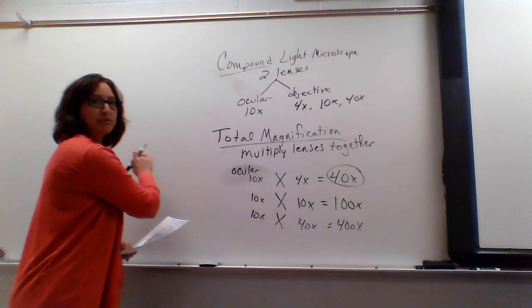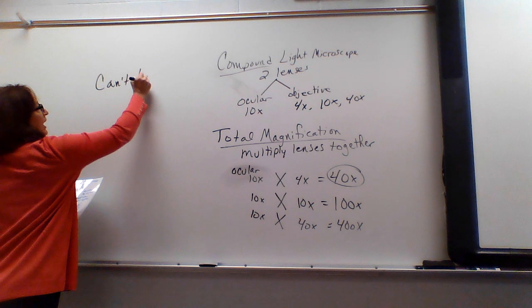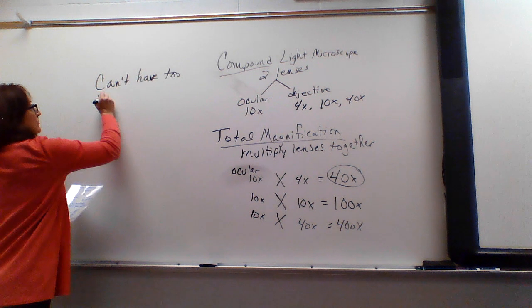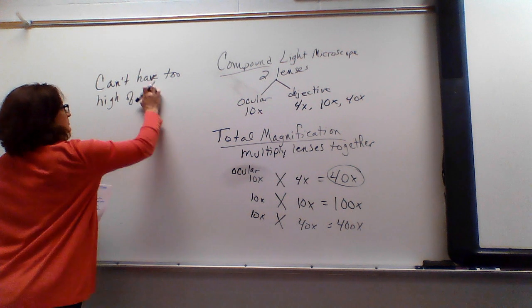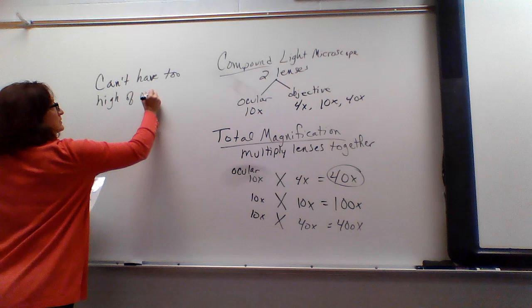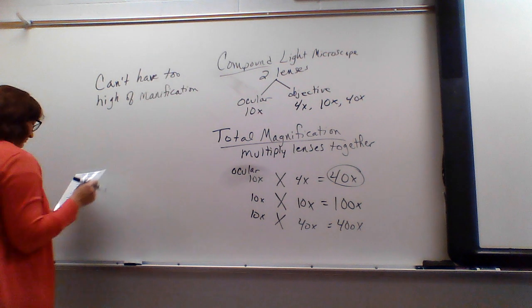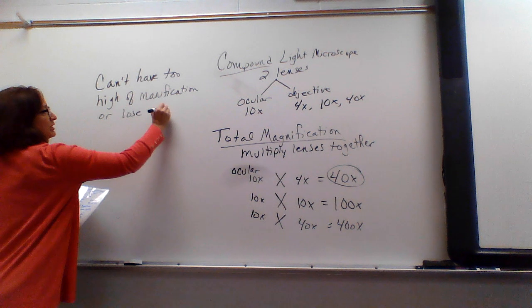Let's see, it looks like I've got room over here you can see. Let's just write that down. You can't have to be too high of magnification, or you lose resolution.